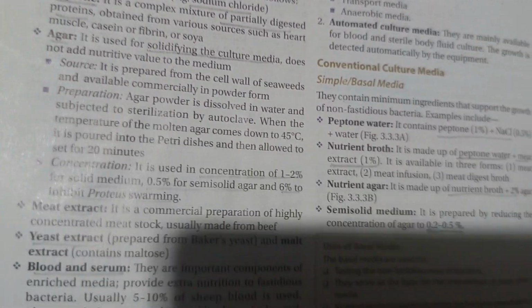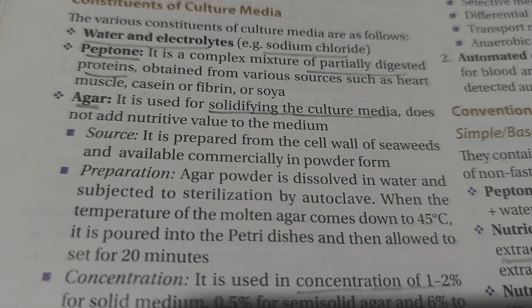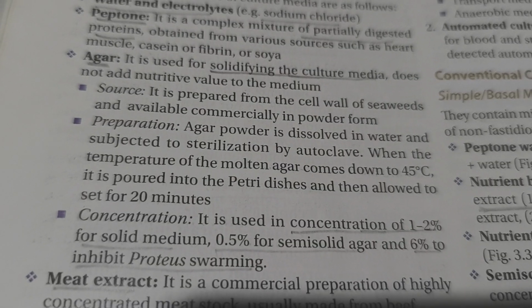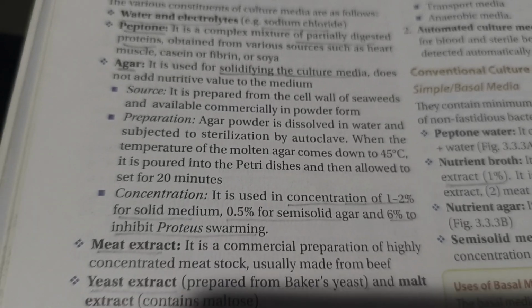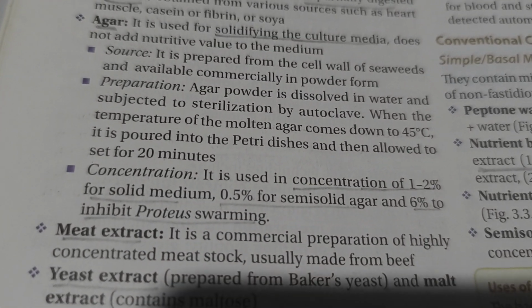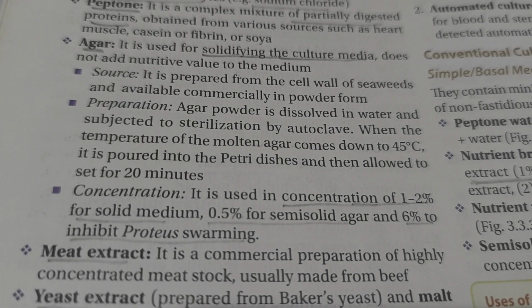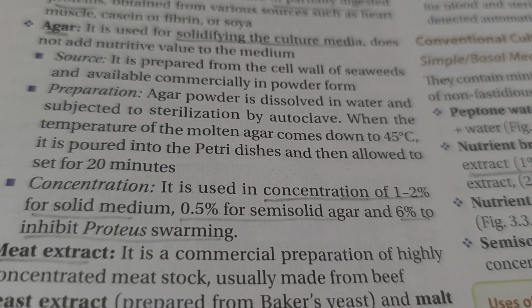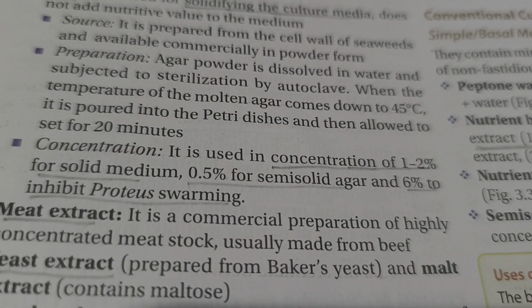Sources. So the constituents of culture media are water and electrolytes, peptones, which are a complex mixture of partially digested protein obtained from various sources such as heart muscle, casein and fibrin or soya, and agar, which is used for solidifying the culture media and does not add nutritive value to the medium. Source: it is prepared from the cell wall of seaweeds and available commercially in powder form.